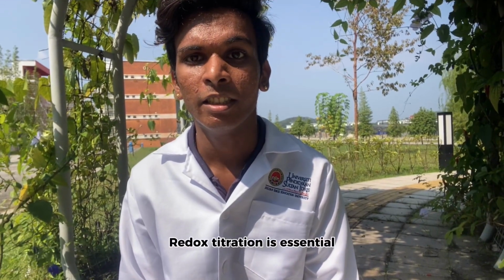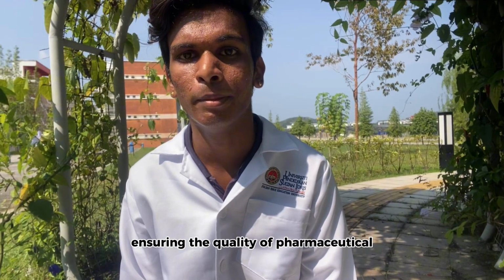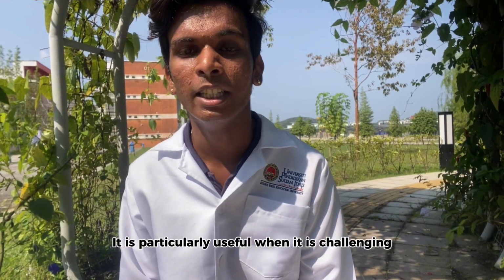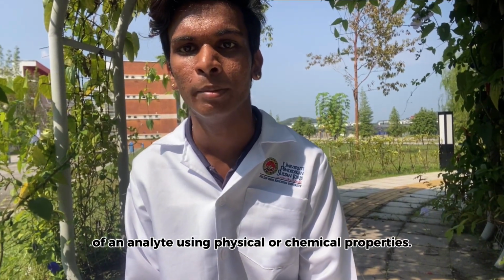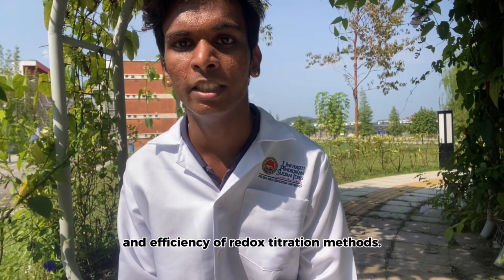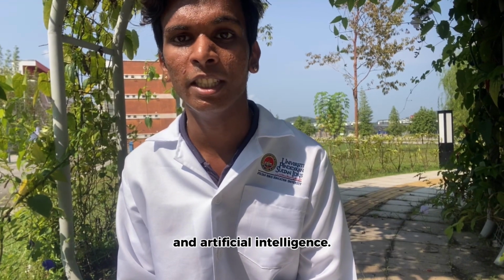Redox titration is essential for determining the safety and efficiency of products, ensuring the quality of pharmaceutical and food products, and maintaining ecological balance. It is particularly useful when it is challenging to directly measure the concentration of an analyte using physical or chemical properties. Advancements in analytical instrumentation, automation, and data processing have improved the precision and efficiency of redox titration methods. Future prospects include the integration of robotics and artificial intelligence.